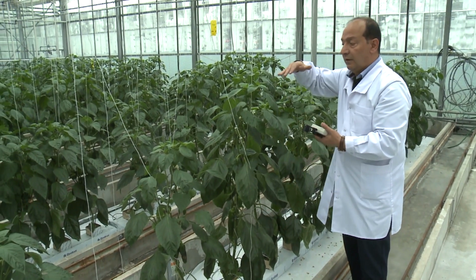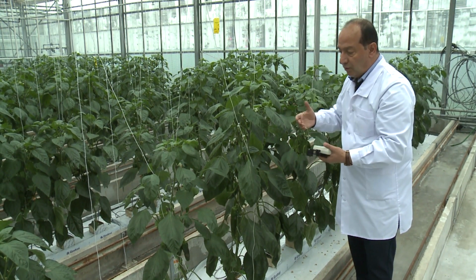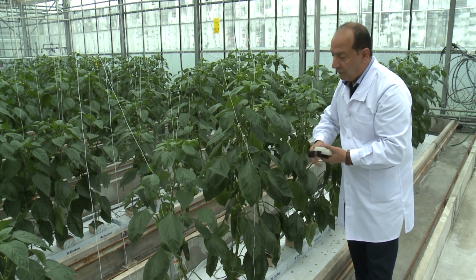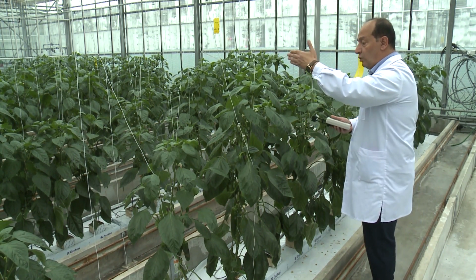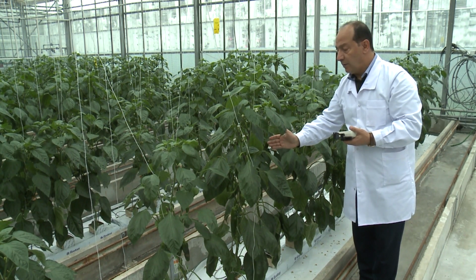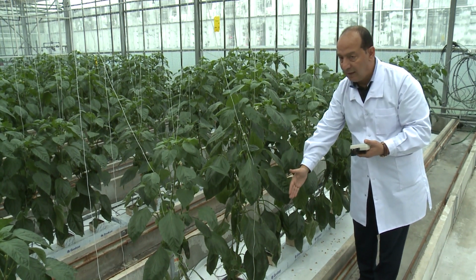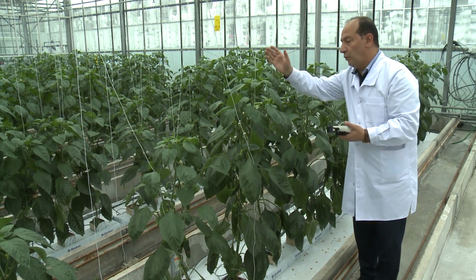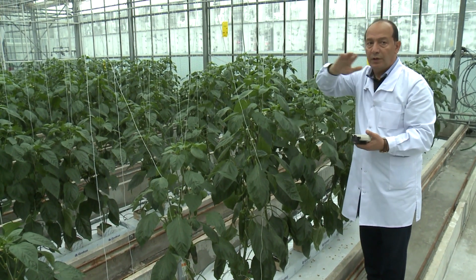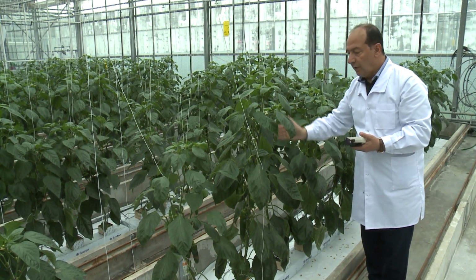Then I have information which is matched or coming from not only one measurement, but different measurements from different levels and ages of the leaves. And we should consider as well the side on which we are doing these measurements. So I would take, for example, for these plants, at least 3 or 4 measurements from that side on different leaf ages. Then we go to the other side, to the third one, and to the fourth one, because the lighting everywhere in nature, or even in the greenhouse, is not equal from each side.